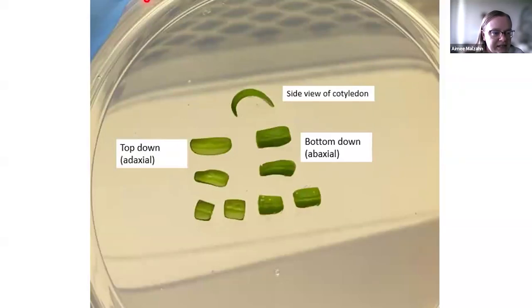Someone had asked, and I don't remember if we talked about this last time, what do you seal your plates with, and have you tried different things to seal the plates? Good question. For the incubation period after the transformation, we do use parafilm, but most of the time we use micropore tape, because under the lights on the shelf, if the plates are wrapped with parafilm, there's a lot of moisture in there. Then when you go to do transfers, you're just inviting possible contamination.